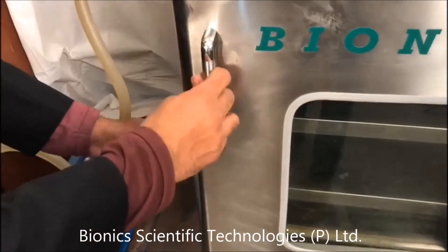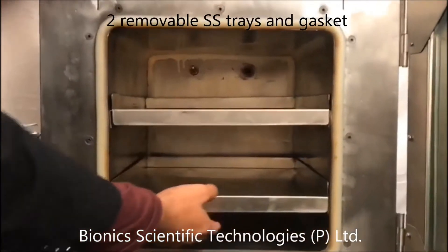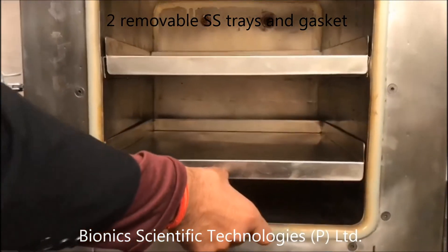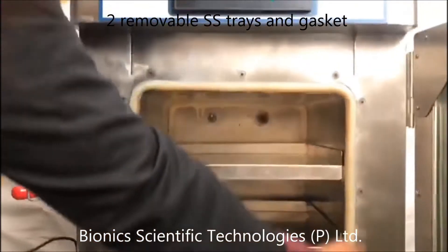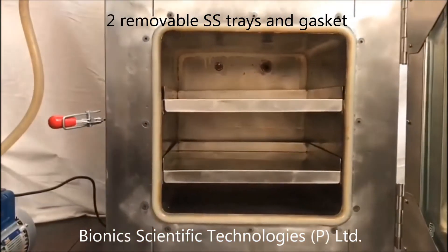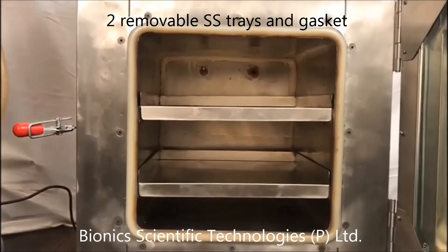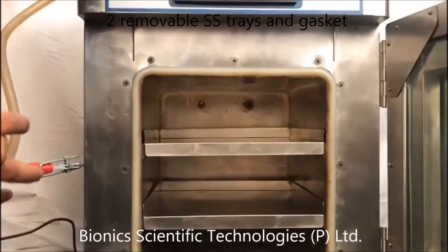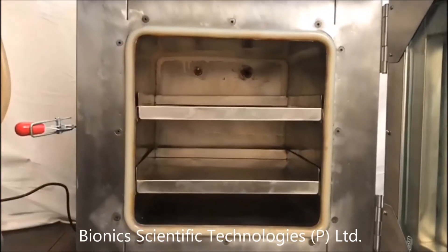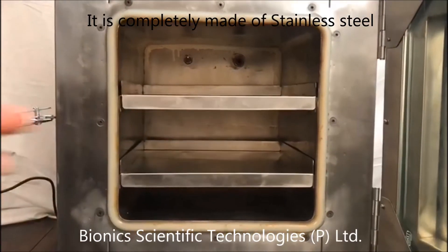This machine is available with two trolleys — these are movable — and with this gasket, which helps in the vacuum. The machine is completely made up of stainless steel, both from the inside and outside.